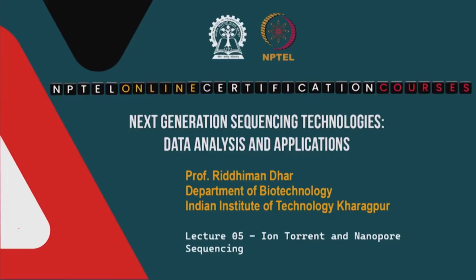In the last few classes we have introduced some of the recent NGS technologies. We have talked about Roche 454, we have talked about Illumina, and then in the last class we have talked about SMRT sequencing. In today's class we will discuss two sequencing technologies in brief. One is called ion torrent sequencing and the other is nanopore sequencing. So, that is the agenda for today's class.